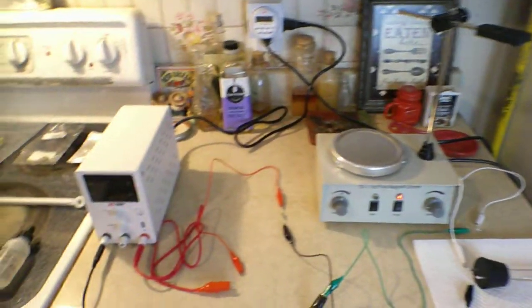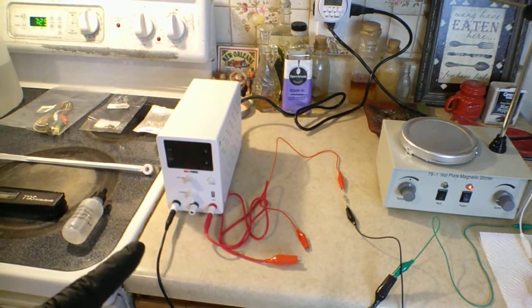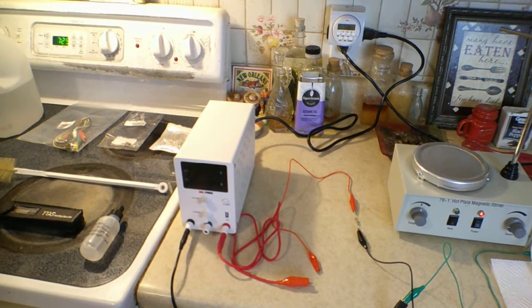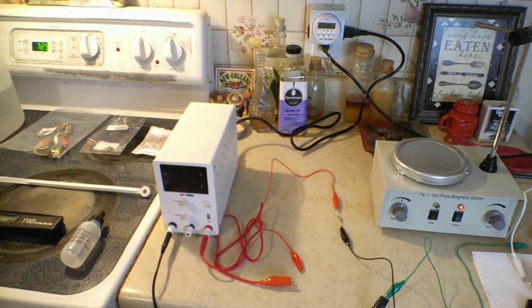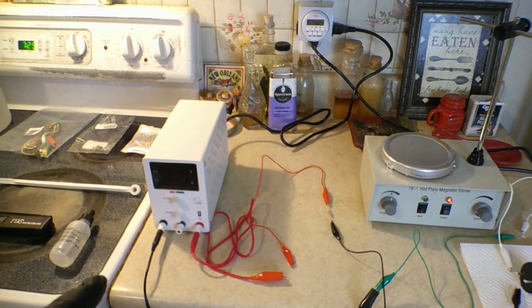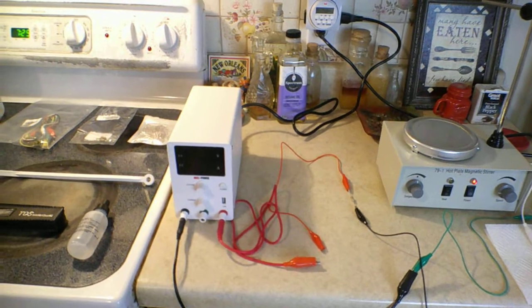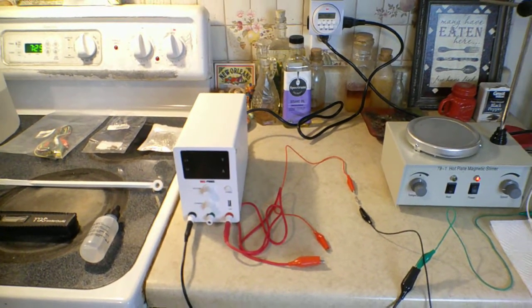The upgrades are obviously the stir bar, but also this DC power supply. I wasn't too hot on using the three 9-volt batteries — they probably burn out pretty fast. For about seventy dollars I got this DC power supply, and it's going to mimic the current and the voltage of those nine-volt batteries.